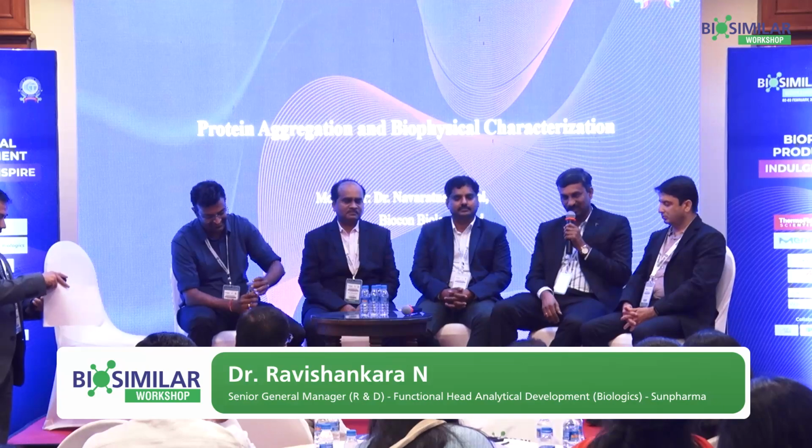Okay, so good question. So this is a future need of FDA. Initially we started with only spectral overlapping in submissions. Then gradually they went on to the numbers, asking how similar it is. Nowadays they're asking for multiple technologies. As Dr. Pradeep is rightly stating, all the technologies are very important from different perspectives, because each gives its own overall picture of your product quality. So that's the ask from the FDA.